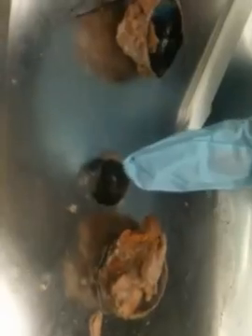And then we can look here. So like I said, this little ball right there is the lens. Okay, it's what focuses the light when it enters the eye. So it's not the pupil? No, the pupil is just a hole. Oh. Is that what dilates? Yeah, right. It's just a hole that gets bigger or smaller, and that puts more light in. Okay, and that's what's actually allowing the light in, right? Yeah.